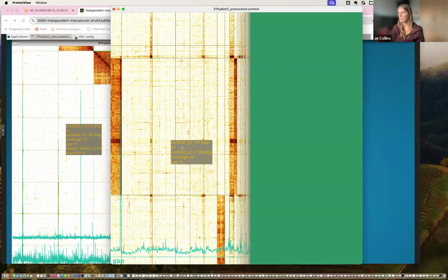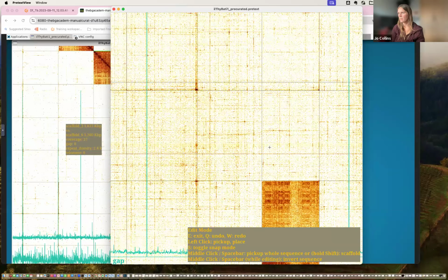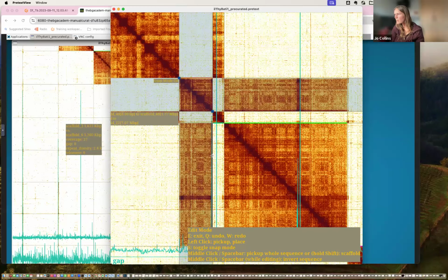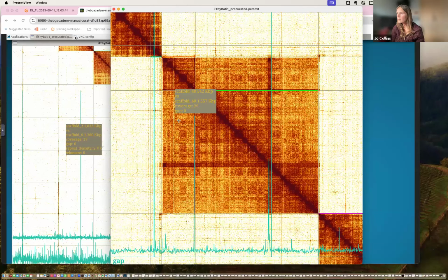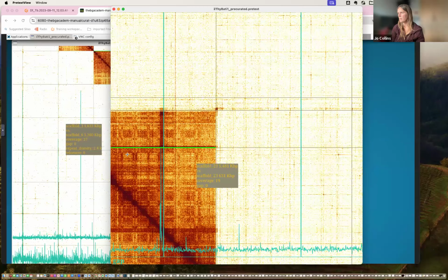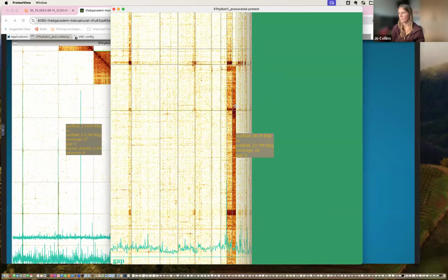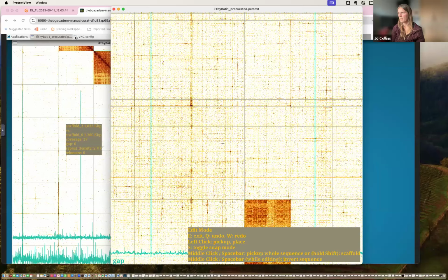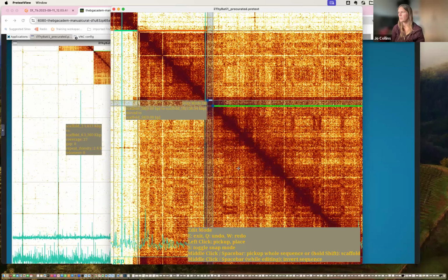And so it looks like we've got some data to put in here potentially. It's like it goes like that, so in the middle. And just grab the other piece. Few bits to put in here, so I'm just going to bring them over to see. That will help us.